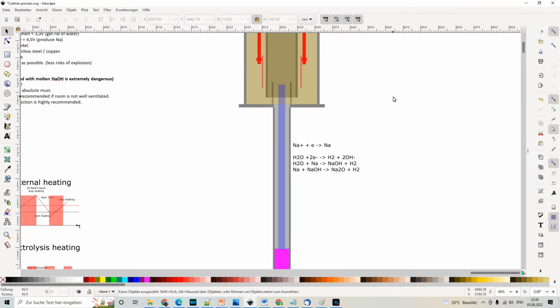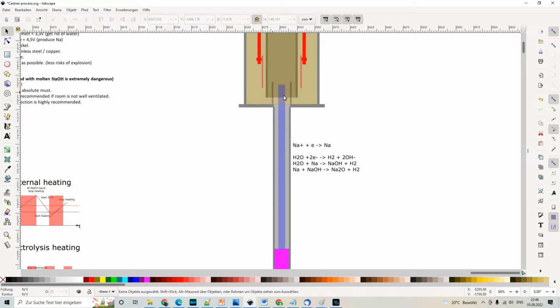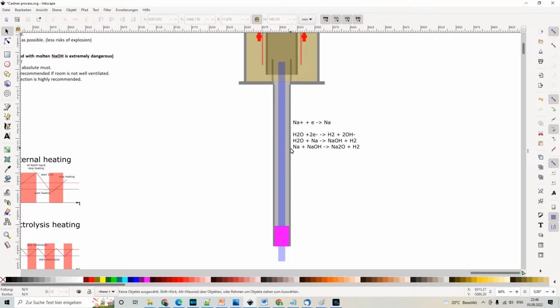When designing a bottom-up electrode, there is always the big question how to insulate this electrode. And Castner came up with a very smart solution. He just used a somewhat long tube in order to contain the cathode. So this tube doesn't touch the cathode, and when the sodium hydroxide starts to melt, it will flow inside this tube. But because you're having a temperature gradient, meaning at the top here it will be hot, but 10 centimeters lower it will be already significantly cooler, the sodium hydroxide will solidify here, and you're having a perfect insulator, and you don't need to take care about the sodium hydroxide eating away your insulator.